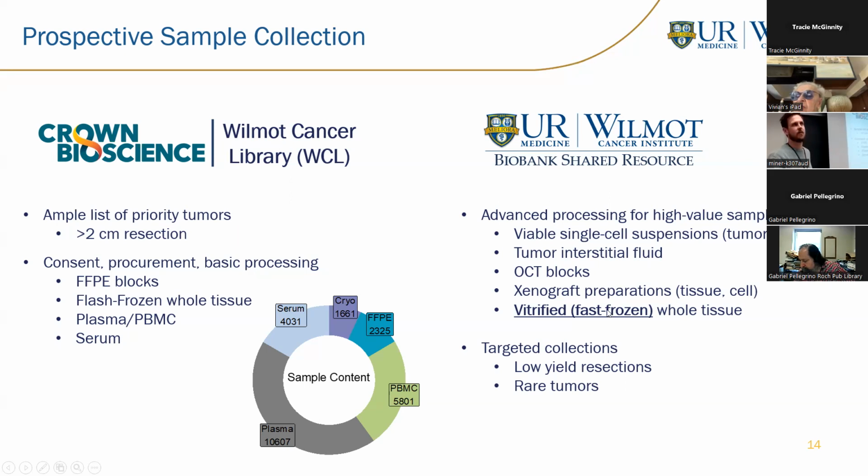In current approaches to preserve whole tissue like that, a slow freeze with standard cryopreservatives isn't that great, especially for tumor. You're going to lose a lot of viability. They've shown some really good results, and I'm hoping this collaboration keeps momentum moving forward. And if I have any colleagues in neurology, I'd really be interested in talking to you. They're specifically interested in brain tissue, and at least in mice, they've shown that their techniques can maintain electrophysiology upon thaw too, which I think is really big and really interesting.